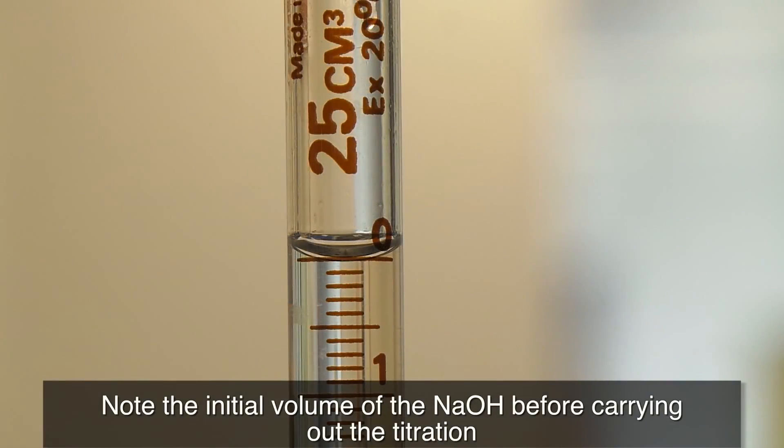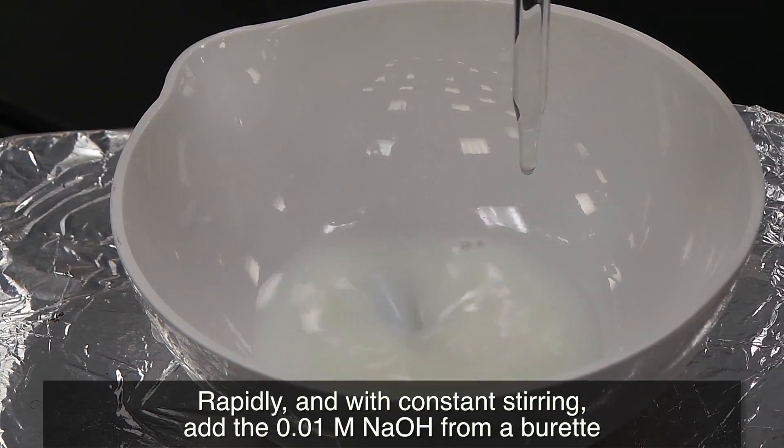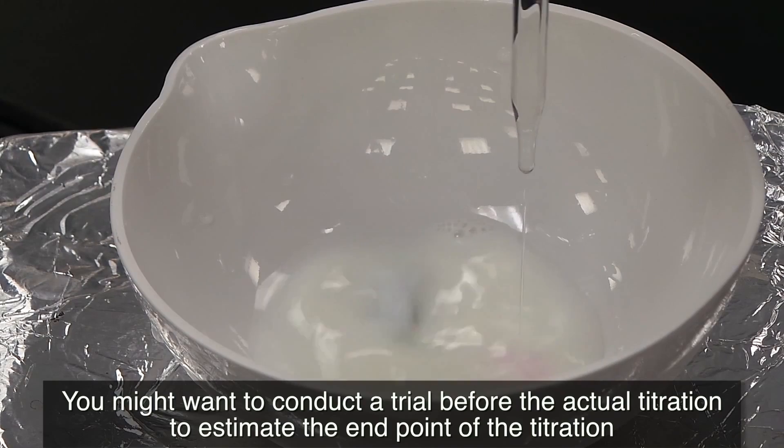Note the initial volume of the NaOH before carrying out the titration. Rapidly, and with constant stirring, add the 0.01 M NaOH from a burette. You might want to conduct a trial before the actual titration to estimate the end point of the titration.